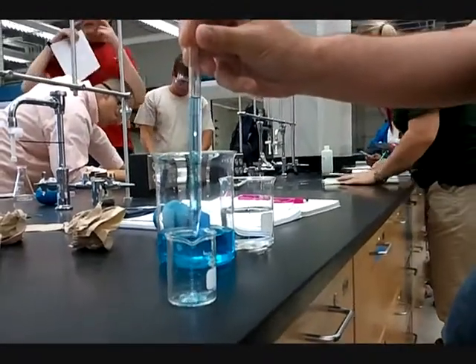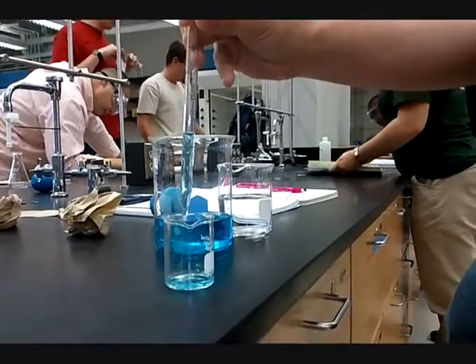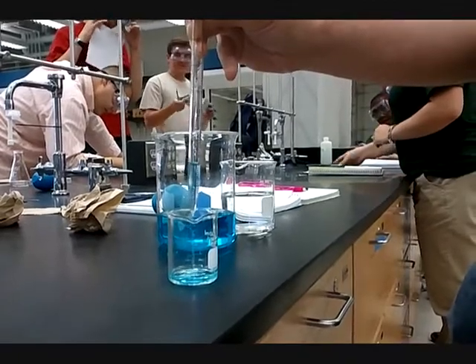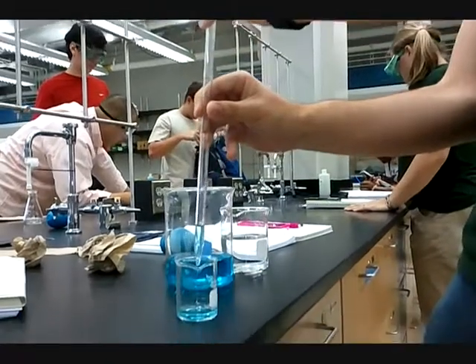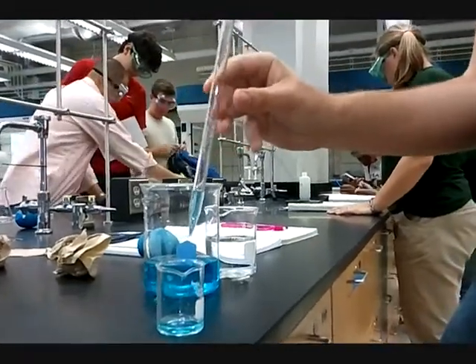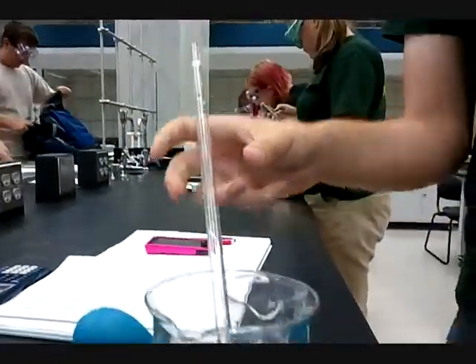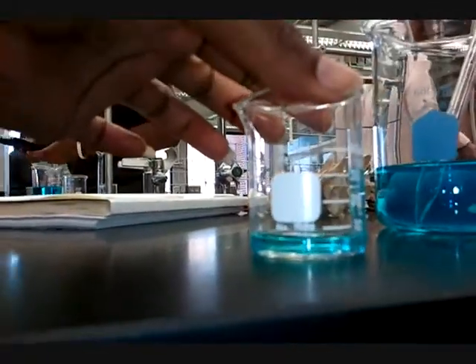Put it out just to the point where it's right at the mark. Right at the top. Touch the side. It's dry. And you measure it from there. You take the measurements together and divide by 6.